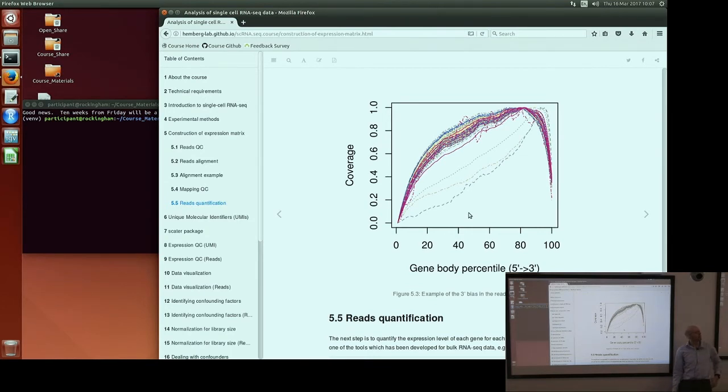Sorry, I missed what the upstream methodology for this was. Was it Fluidigm? Did I miss that bit? Tallulah, what was it? This was Fluidigm C1. So Smart-seq 2, right? I think they use Smarter, isn't it? Or did you put your own in? It was Smart-seq or Smart-seq 2. I don't remember exactly.